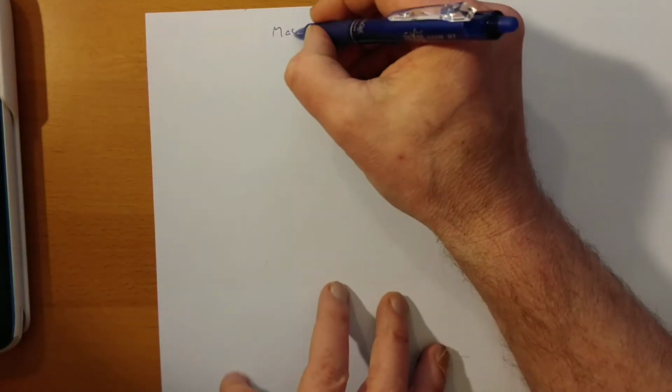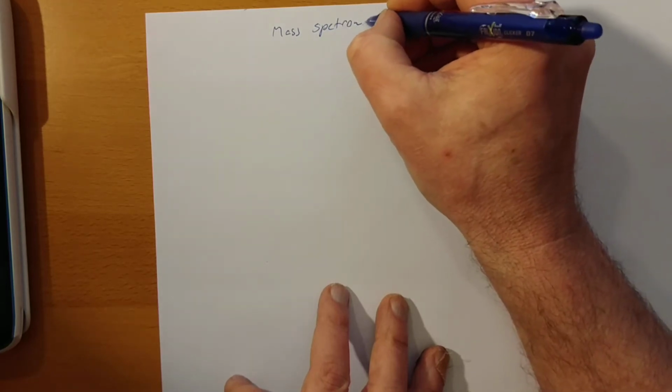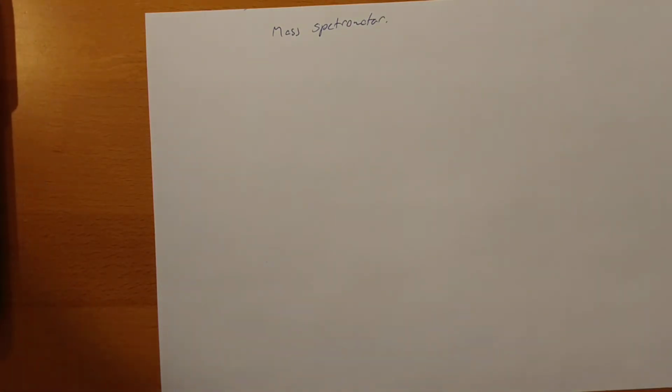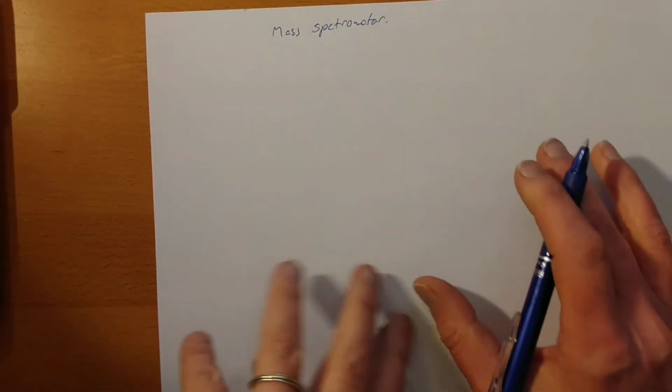Hello, Maurits here. This video is about the mass spectrometer. A mass spectrometer is basically a machine that separates particles depending on their mass. So for example, if one wants to analyze some chemical substance, we could separate the molecules or the atoms in some way depending on the mass.